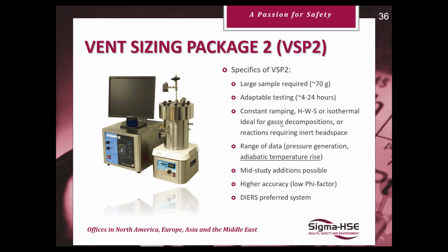So these systems can work in various different modes, but for thermal stability assessment, it would normally be the constant ramping mode. And again, this is a very low phi factor system, particularly if you're using it in the open cell function, just the same as the AirSST.